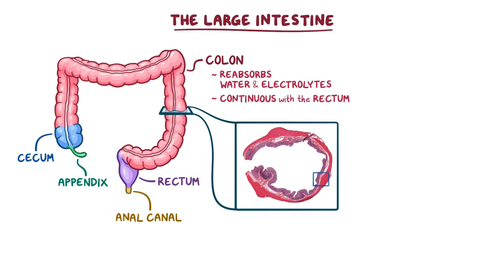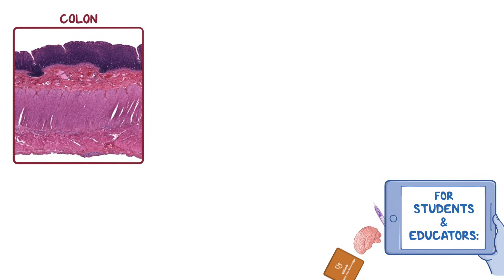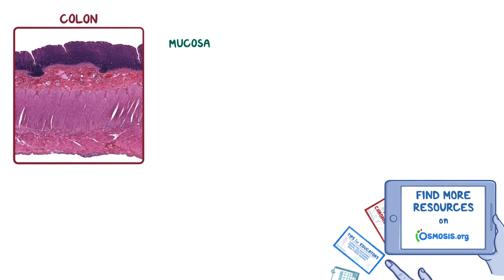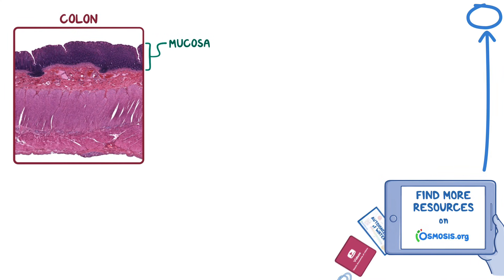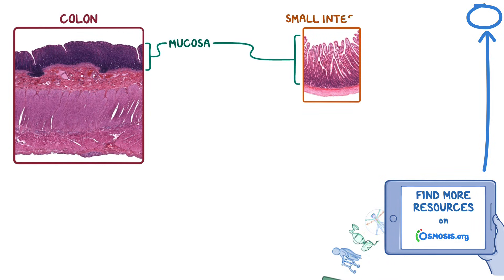Similar to the rest of the large intestine, the colon has four main layers: the mucosa, submucosa, muscularis propria, and a surrounding serosal layer of connective tissue that isn't seen in this image. Even at low magnification, we can see that the colon's mucosa at the top of this image doesn't have the distinct long villi or finger-like projections that would normally be seen in the small intestine.